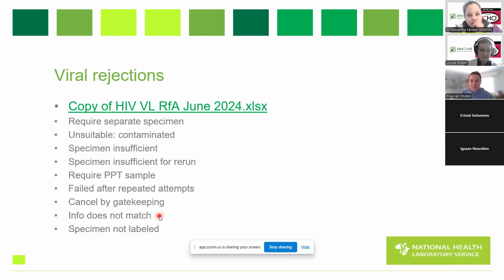Just a quick tip, and it's my last thing, and then I'm going to sign off. Sometimes when the patient stickers are in the folder, make sure that the stickers in the folder are the ones that belong to that patient. Far too often I have seen a data clerk print a set of stickers, pull them off, but leave one or two behind of that patient. Then she prints another set of a different patient, and those two of the previous patient end up in the folder. You are not looking, you're just taking off stickers and putting them on, and that's how Peter happens to be on the specimen and Paul happens to be on the form. We are going to reject those specimens.